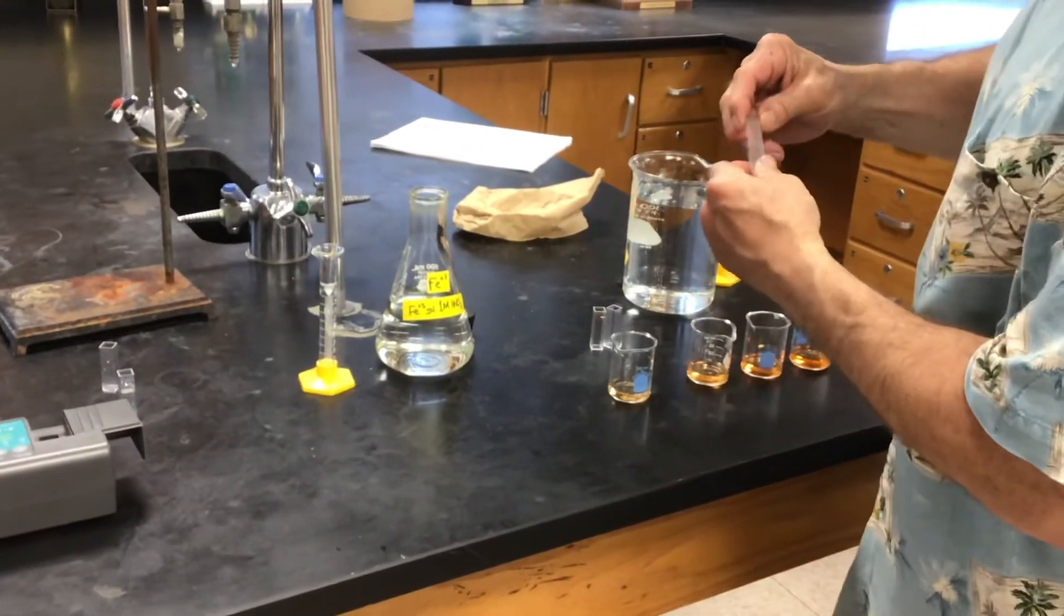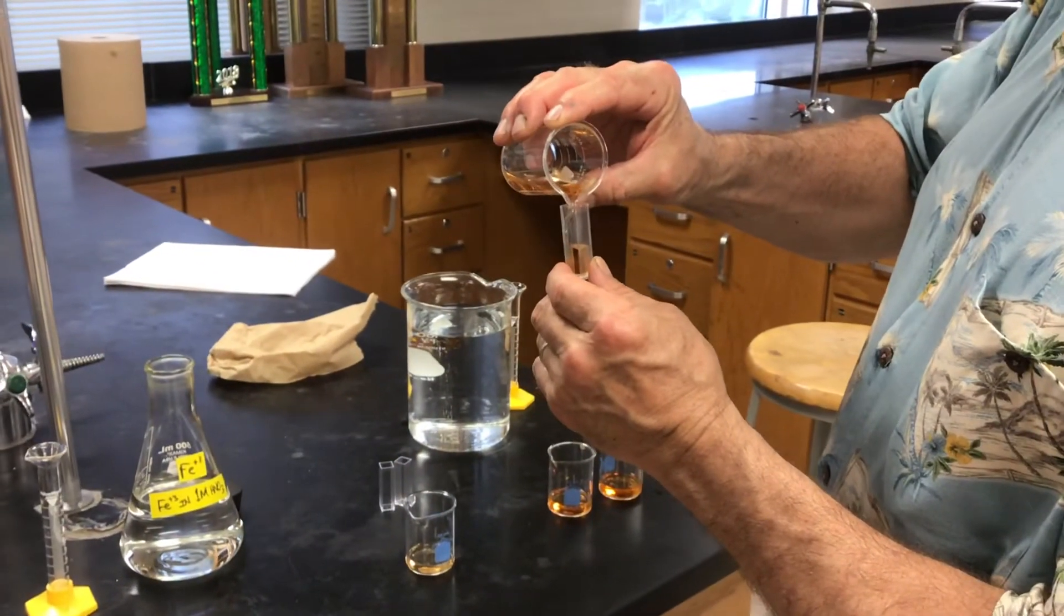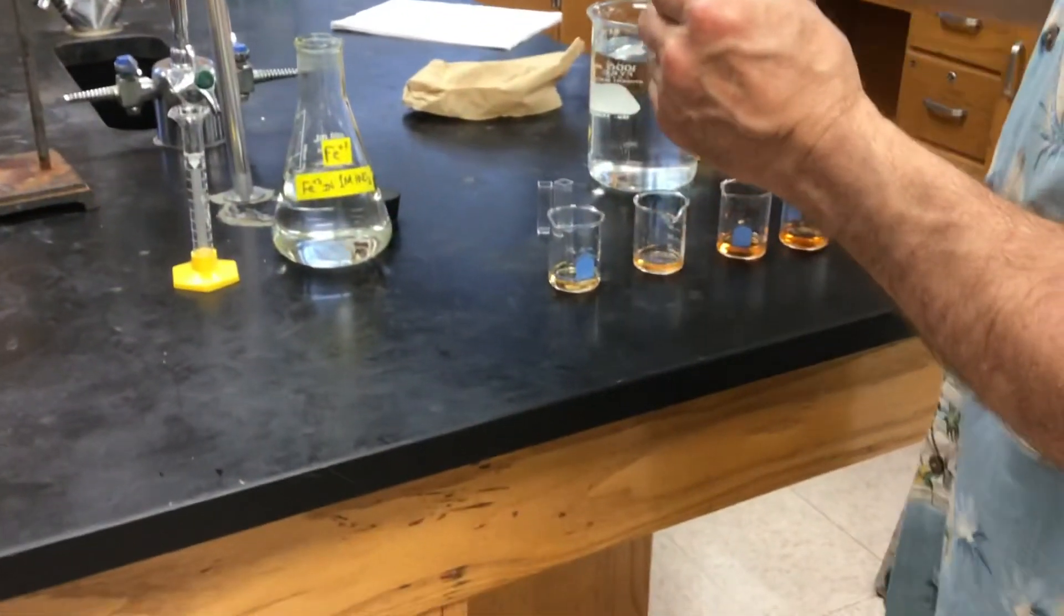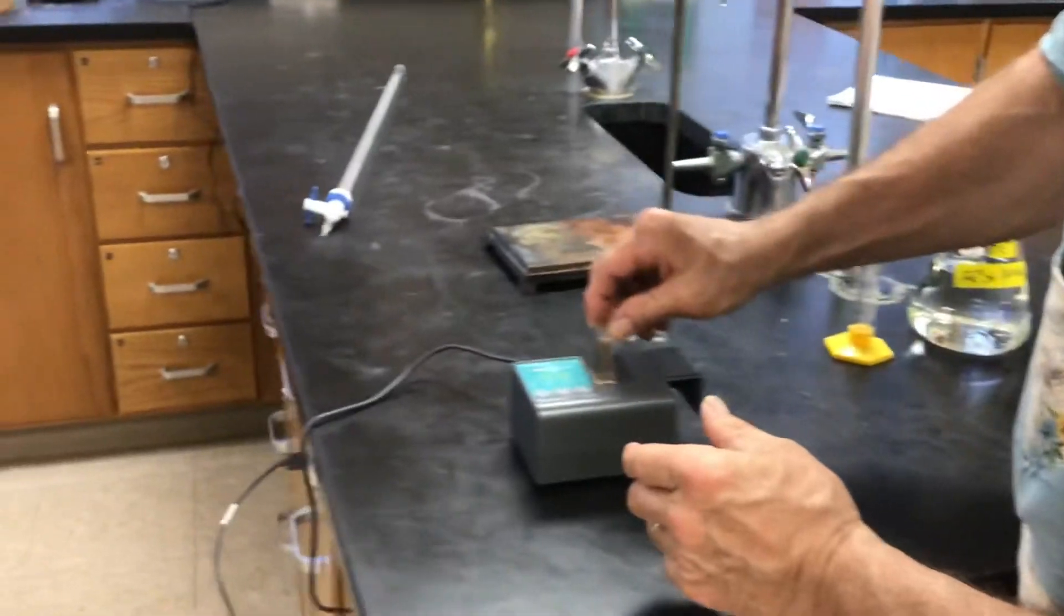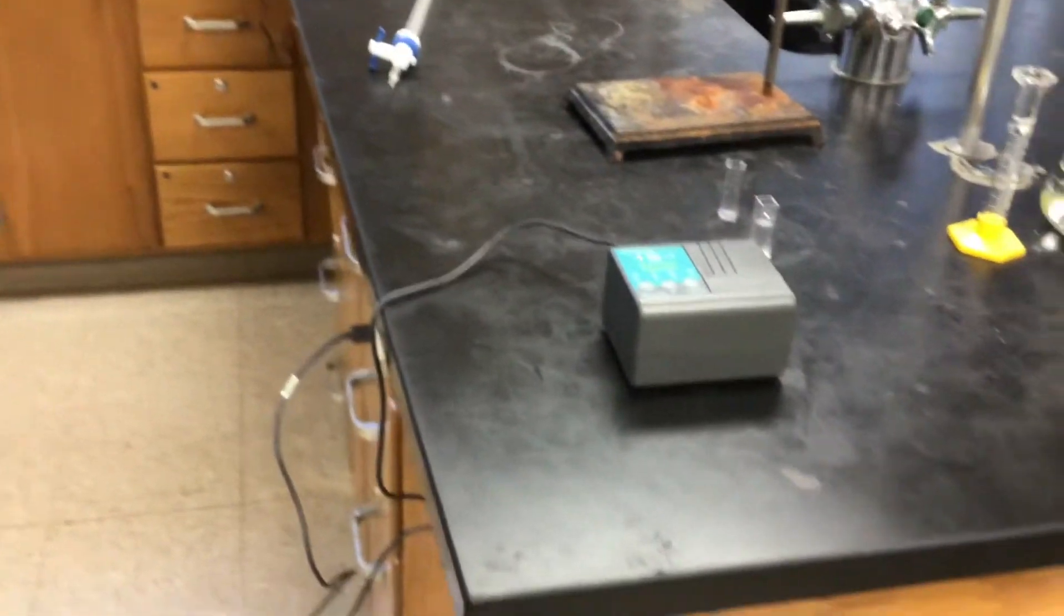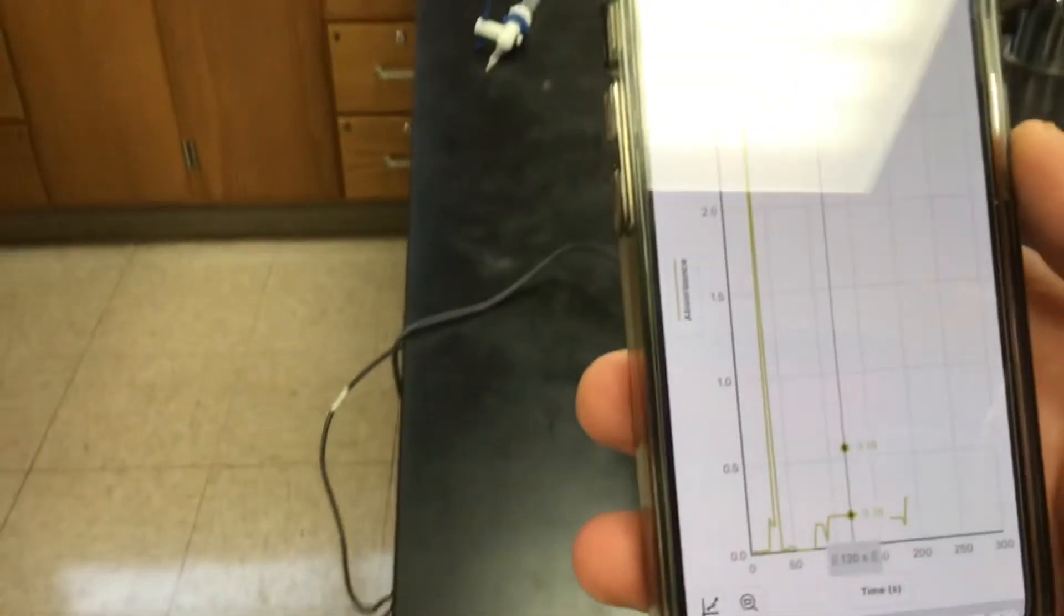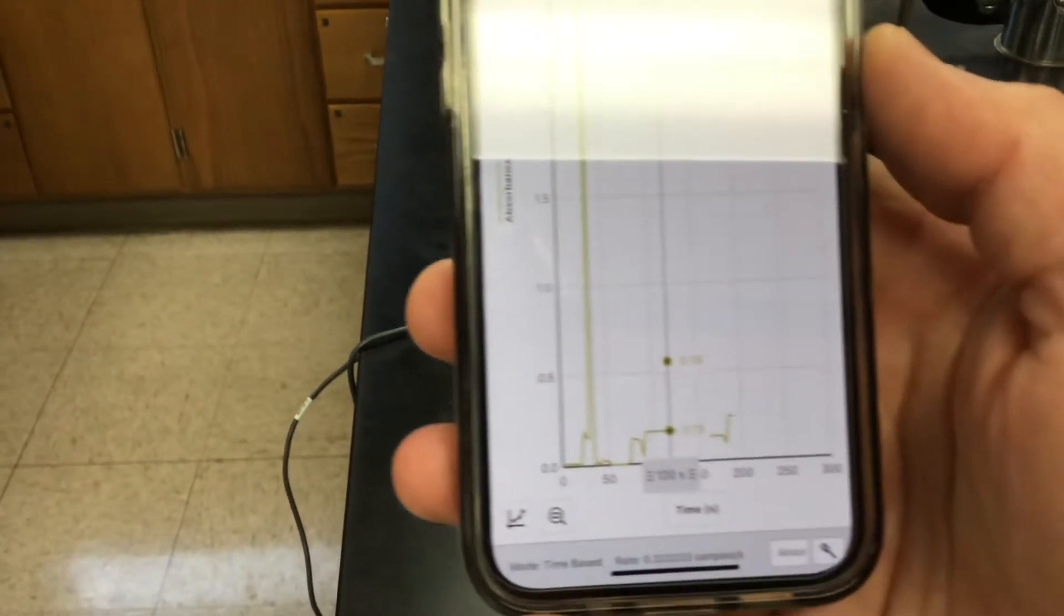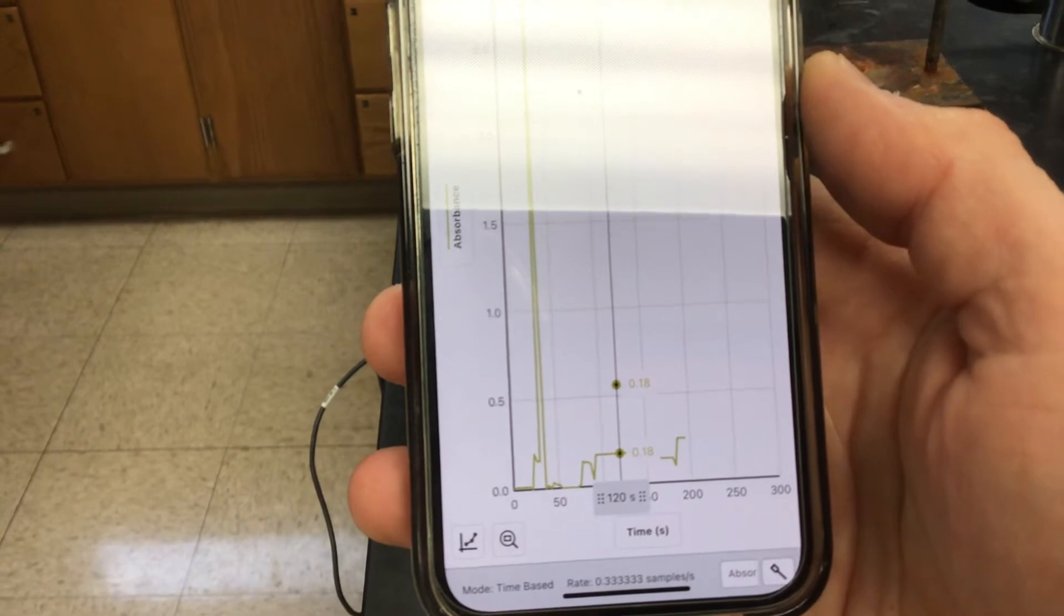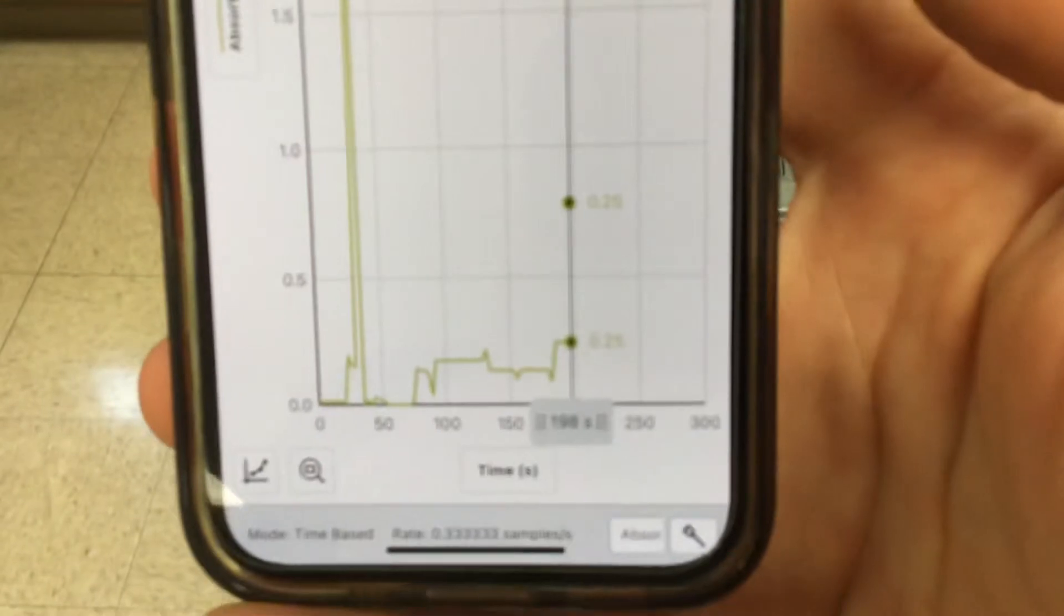Okay. Here comes trial two. You can tell from looking at the solutions get progressively darker. Maybe it's because the reactant solutions are more concentrated. So trial two goes in here and we're going to see the absorbance is higher and it looks like it's 0.25.